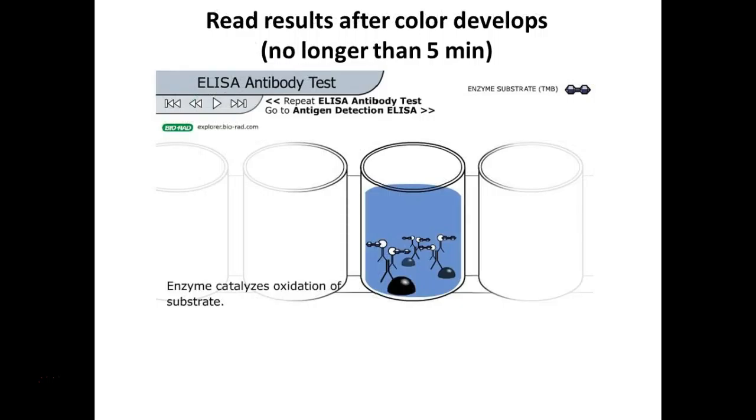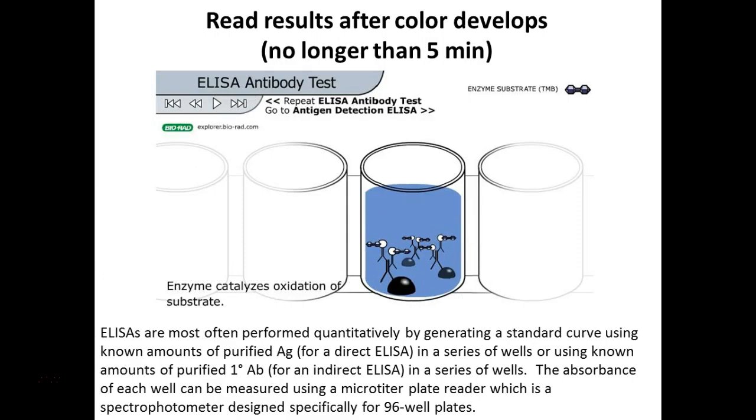So I could only do so many plates at a time because I could only go so fast, putting a plate on the machine, reading it, and getting the next plate on and reading it as well. But sometimes I would wait to put the substrate in, so that I could run a set of plates, then do the last step, run a set of plates, so I don't have to worry about the time for that.